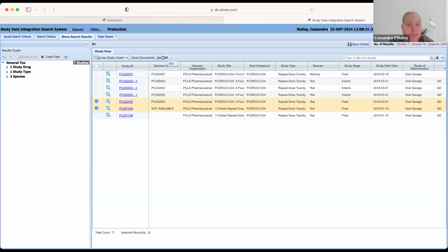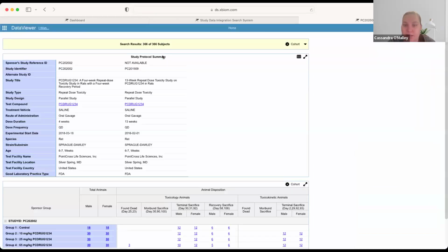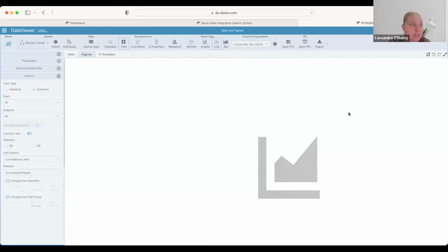So now I'm going to open these in the IGO. It's going to take a moment, but as I'm opening it, the 2 studies are in this interactive graphical interface. As I've previously mentioned, everything shown today is live and web-based. This is a real loading time, and despite having this information in the back end, these buckets of information, it does interact pretty quickly. But if there is a moment of loading, it's because it is loading these 2 studies live. So I'm going to click on the body weights and look at these 2 studies together.